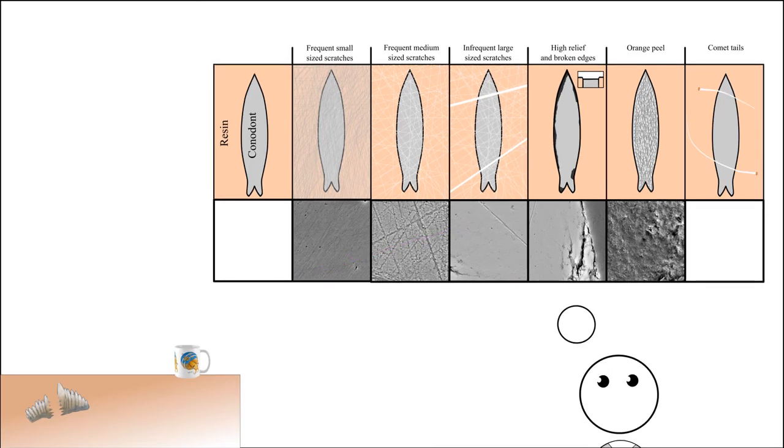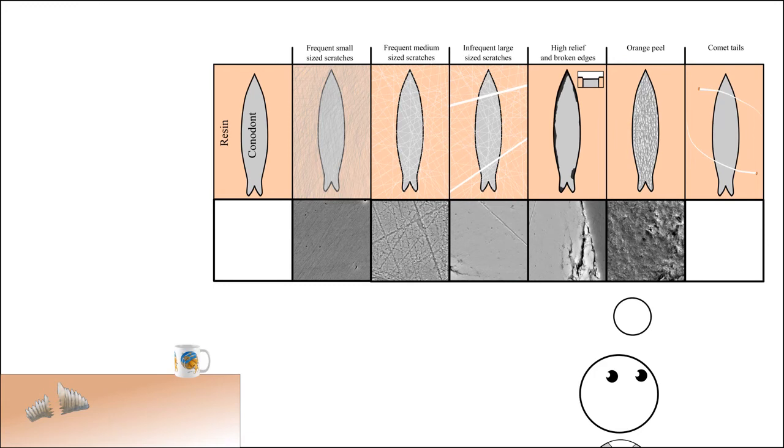High relief and broken edges is just caused by the difference in hardness between your resin and your sample. If you see that this is occurring you can apply just a little bit more pressure and this should allow both the resin and the sample to be polished away at the same speed. The orange peel texture is a high topography texture and this is caused either by over polishing or too much pressure. So if you see this you just pull that back a little bit and it should be removed.